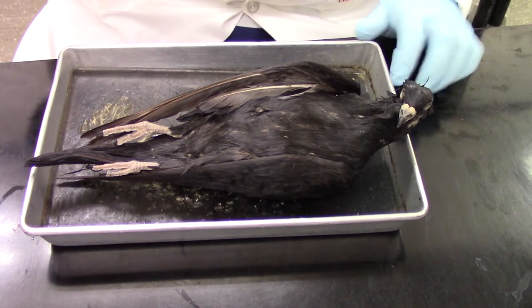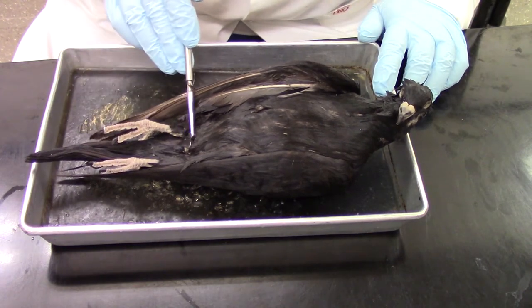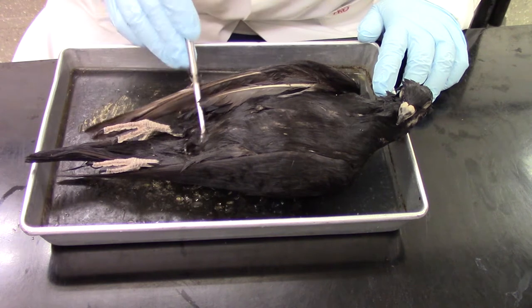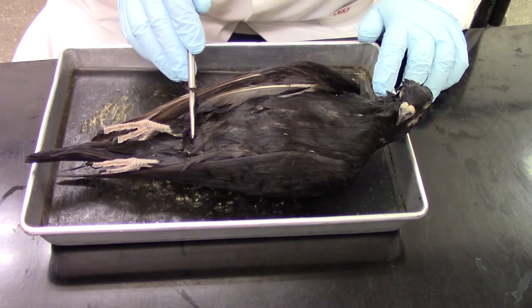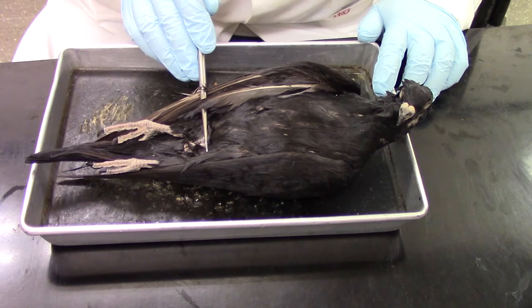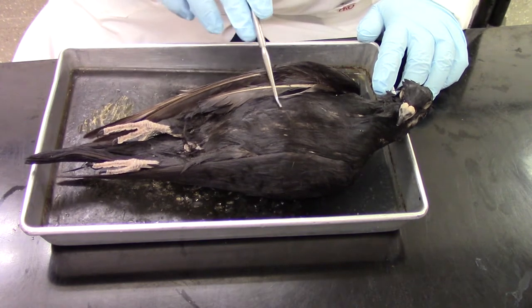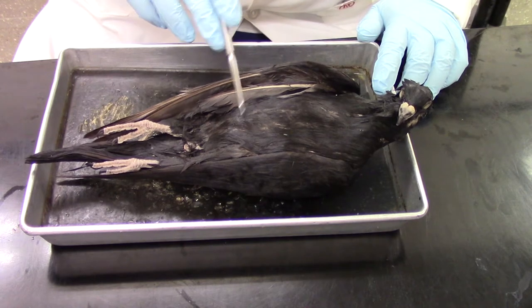If we go down towards the tail, we should be able to find the cloacal opening. Here we can find the opening to the cloaca right there. Right now we've got the bird's ventral side facing upwards.